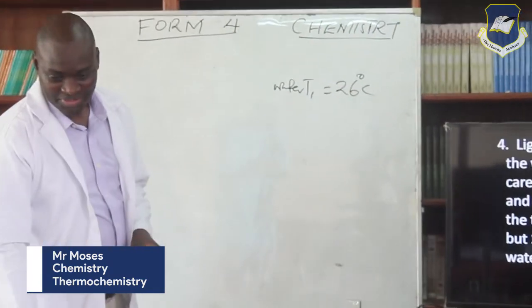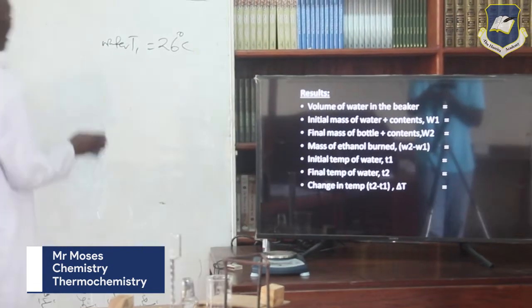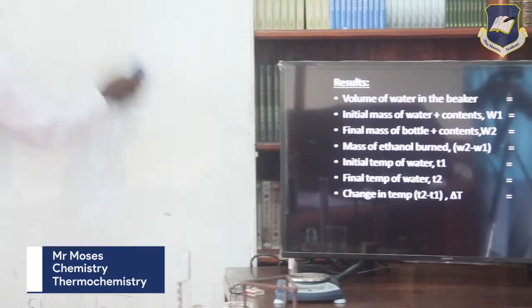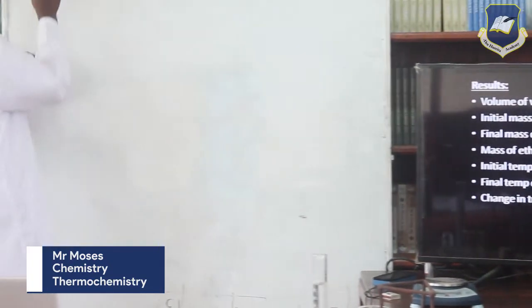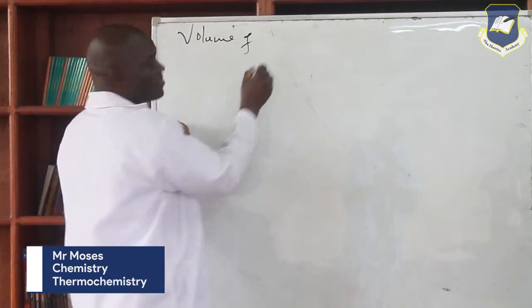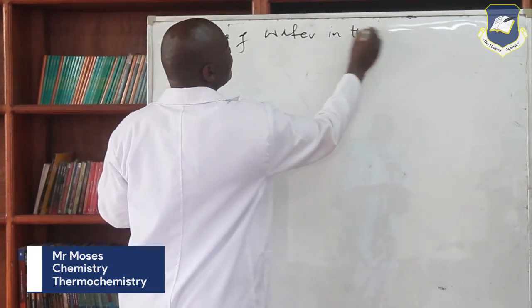Now, that will take us to this table, which I will use later. Here I will have the volume of water in the beaker.